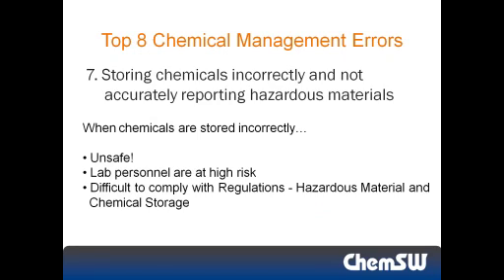At universities, students are at significant risk of injury when containers are not labeled properly and precautions are not taken when working with and storing that material. Organizations will also be out of compliance with the codes and standards issued by organizations such as NFPA, IBC, IFC, if they're not identifying, labeling, and storing hazardous materials properly.